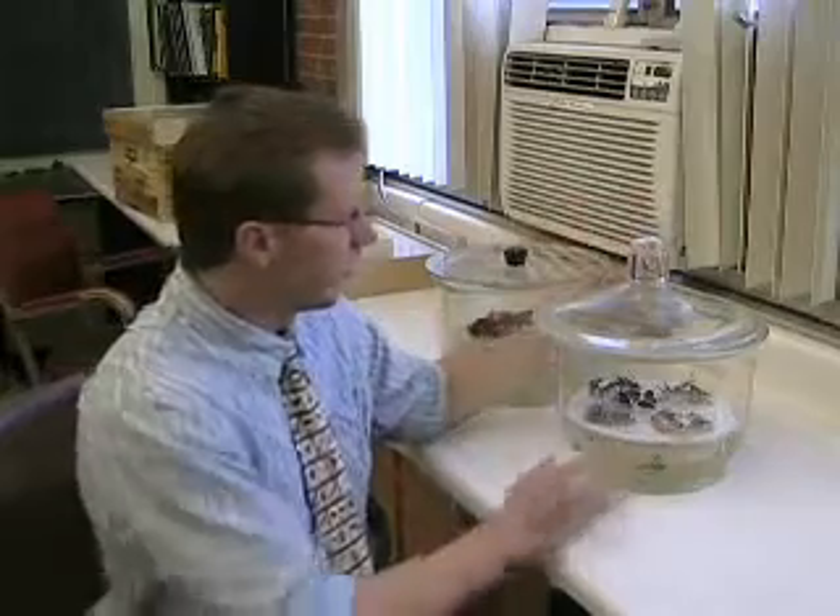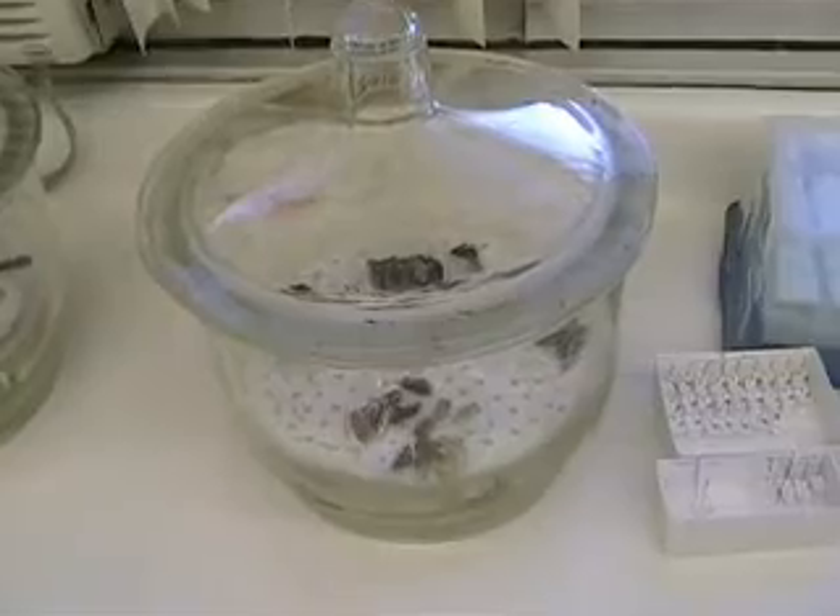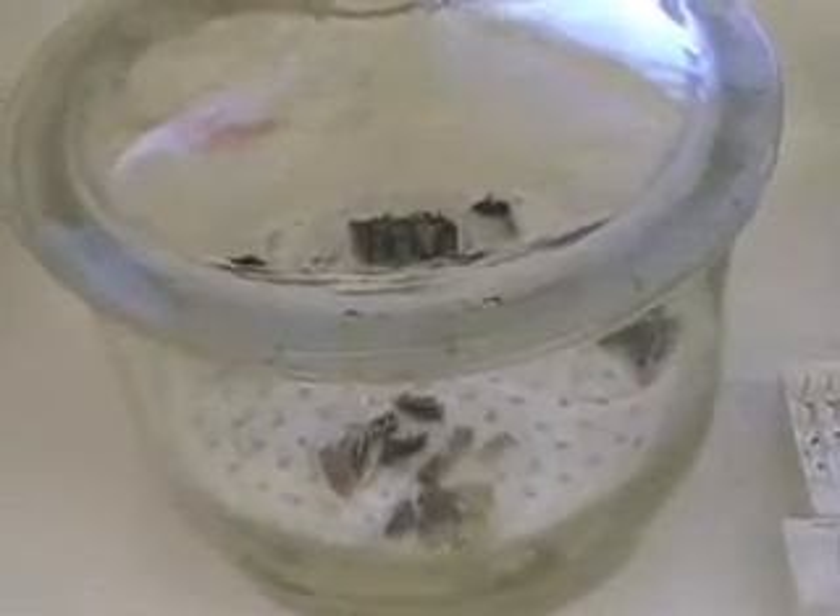This right here is a bell jar. It's a glass chamber, and it creates humidity. They use these for many different labs, either for rehydrating or dehydrating chemicals or specimens, etc.